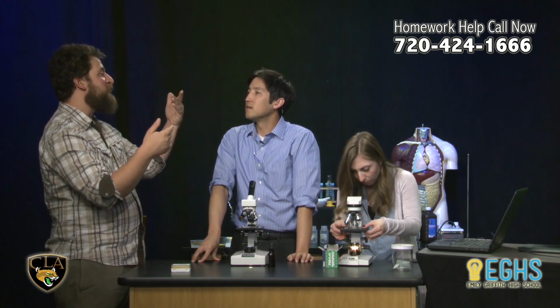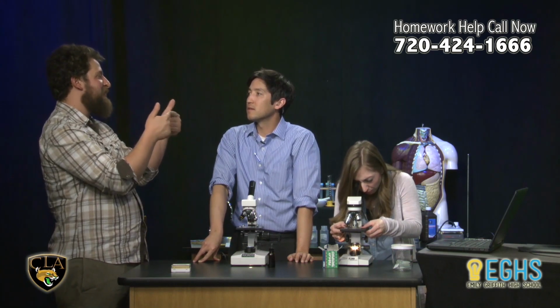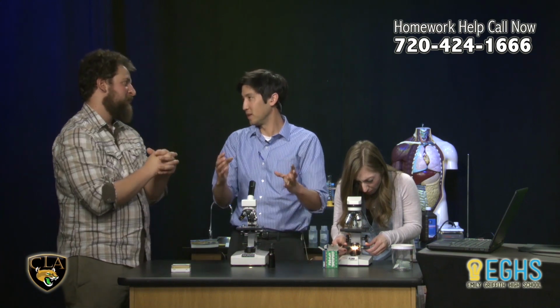Center? Okay. So that's the line at the center. What you really want to do is push the part of the specimen you want to see most to the end of that needle. That's the center right there. As you zoom in from there, whatever you positioned right in front of that will be at the center. That way I don't lose it whenever I'm zooming.